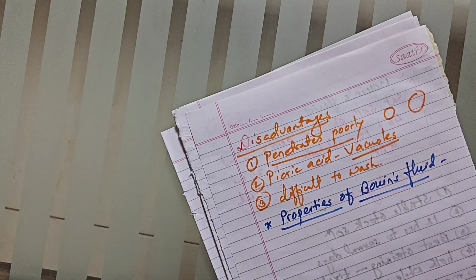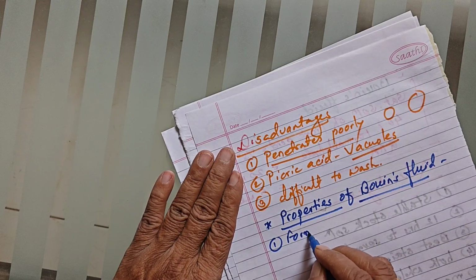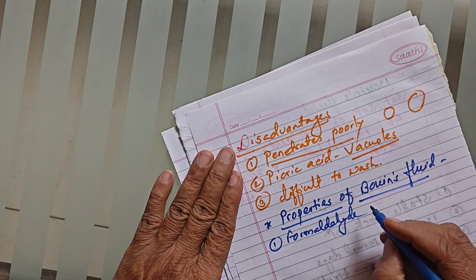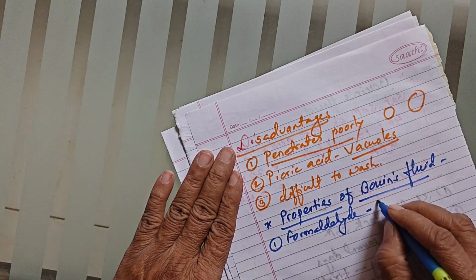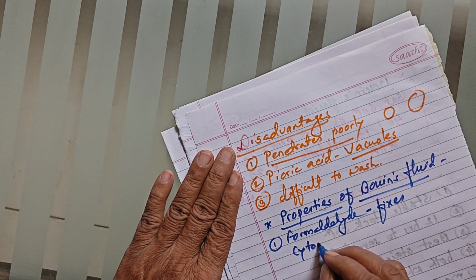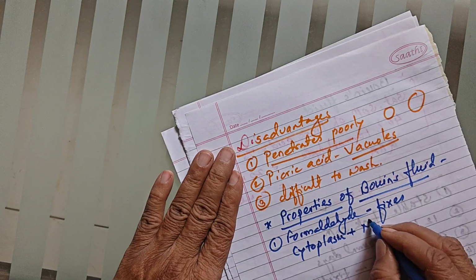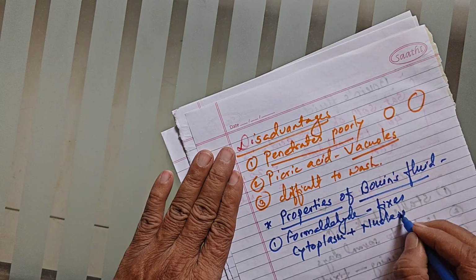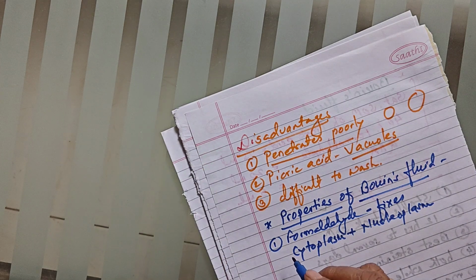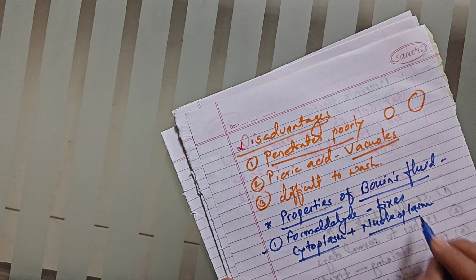So here formaldehyde fixes cytoplasm as well as nucleoplasm very well. That is, formaldehyde has the ability to fix both cytoplasm and nucleoplasm.